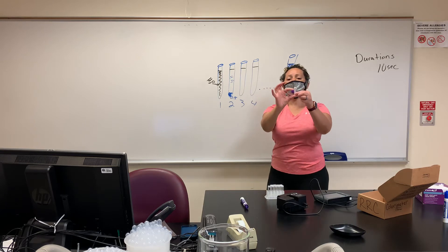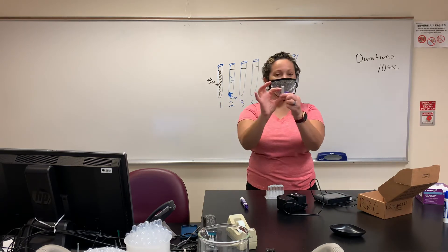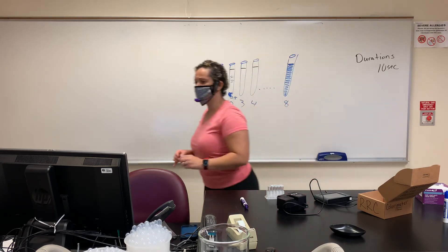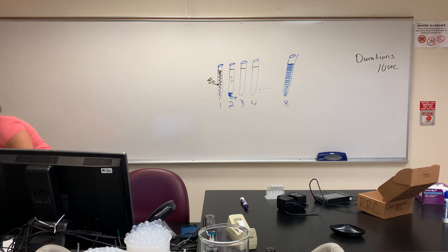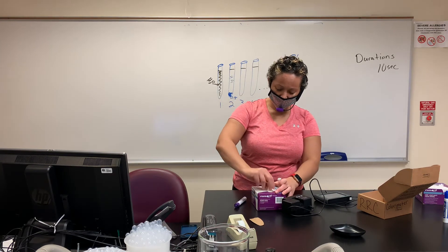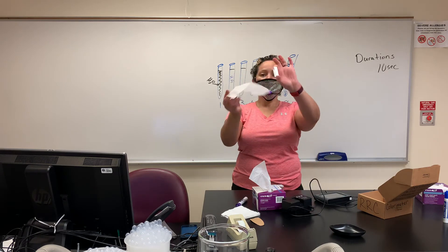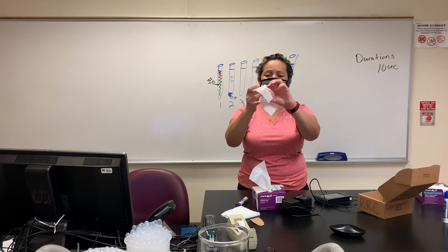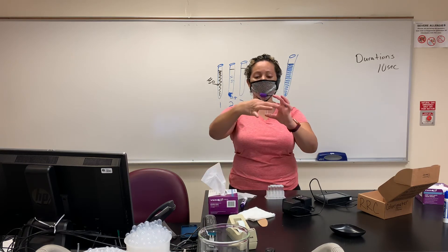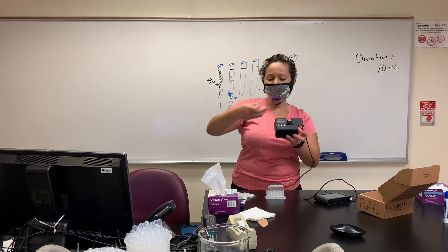Label it number one and fill it up — not quite more than three-fourths, I'd say seven-eighths. Always have a lid. Then you're going to clean it off with tissue paper. You have a serrated side and a smooth side — make sure you are cleaning off the smooth side so fingerprints don't affect your readings. You can touch the serrated side.